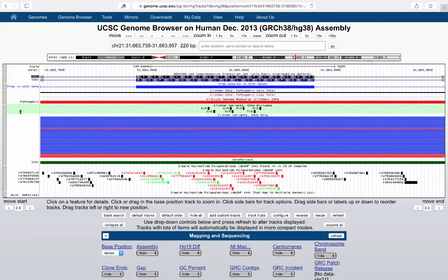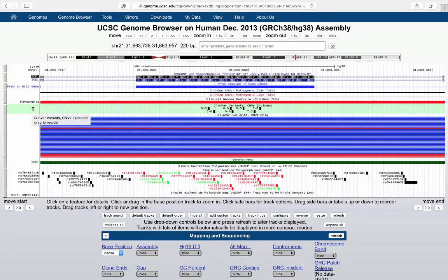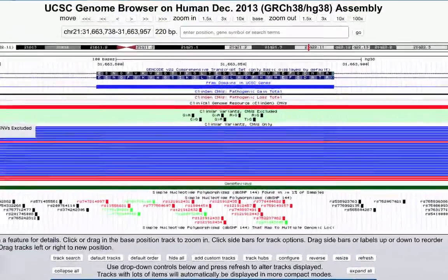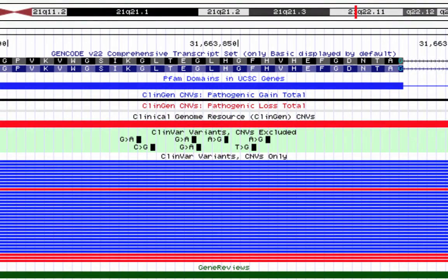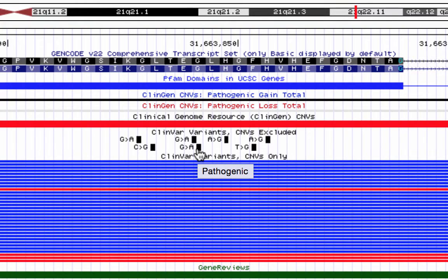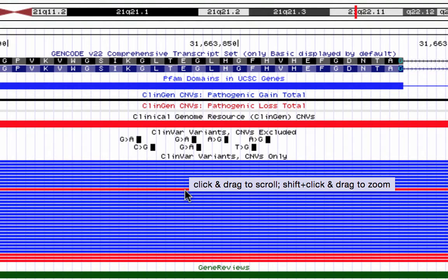Looking at the ClinVar variants and ClinVar variants CNVs-only tracks, you can see variants that are in the ClinVar database — these are variants associated with genetic disorders. In the top part of the track you have variants only, and when zoomed in this far it tells you what the variants are at each position. If you hover over them, it'll tell you something about what they do. For example, this particular G to A is pathogenic. Below that are the CNV tracks; blue are benign and red are pathogenic.